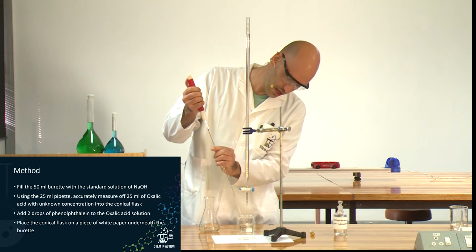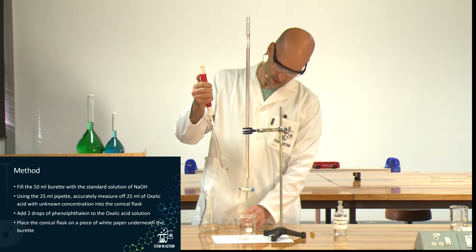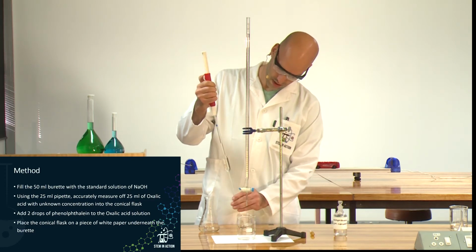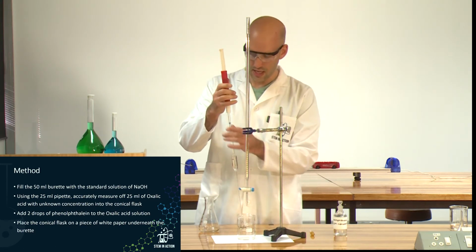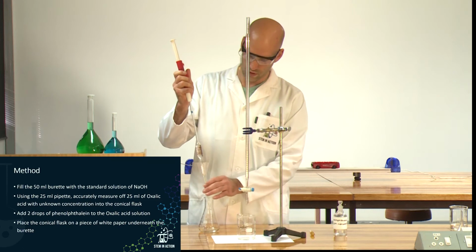So put this in there, and suck it up. Wait a little bit, it goes quite fast, then it slows down for the big bulb. That's why it's called a bulb pipette. Just go slowly until we get to our line for 25 milliliters. I take this out, and I can pipette it into the conical flask.